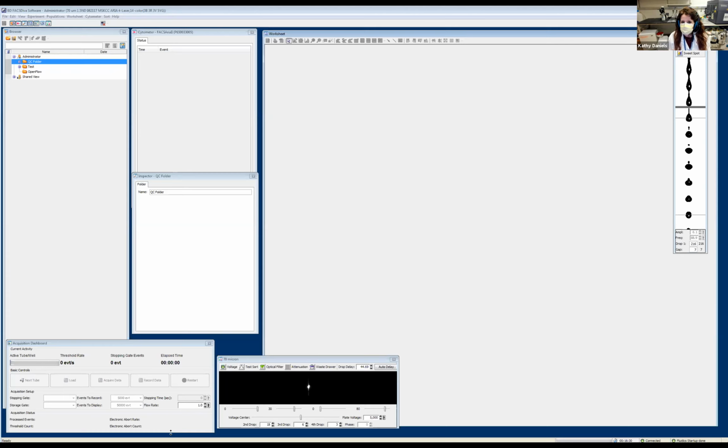The size of the nozzle and the pressure absolutely can have an impact downstream for the cells. So what you want to consider is the size of the cells and the size of the particles you're looking to be working with, so that you can keep that in mind. For when we're going to be doing our sort today, we're going to be sorting lymphocytes, so we've chosen to go with the 70 micron nozzle.